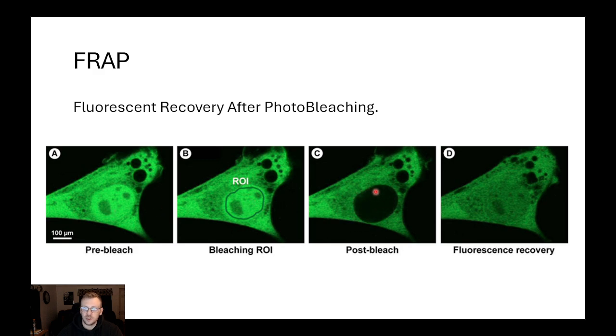And then post-bleach, you're going to end up with a non-fluorescent area because all the fluorophores have been burnt out of it. And then we can start a time lapse, and we can look at the degree of recovery of that fluorophore into that location. And so if you have a highly mobile protein of interest or lipid or anything like that, what you'll see is that as a function of time, you'll actually get more molecules to come in and replace those bleached out molecules that you had. So this is really useful in localization assays.